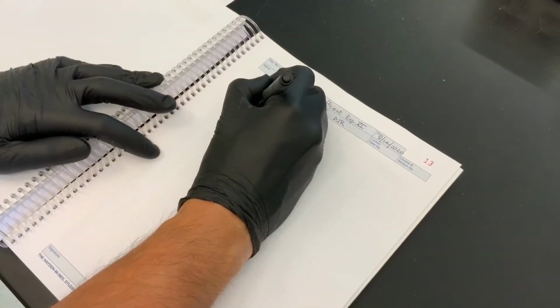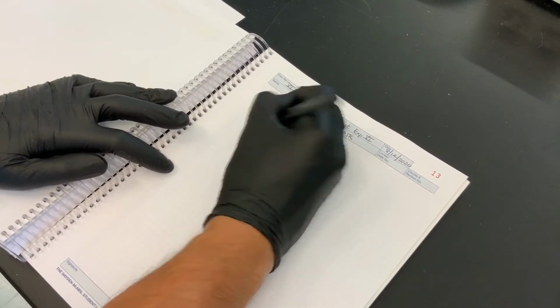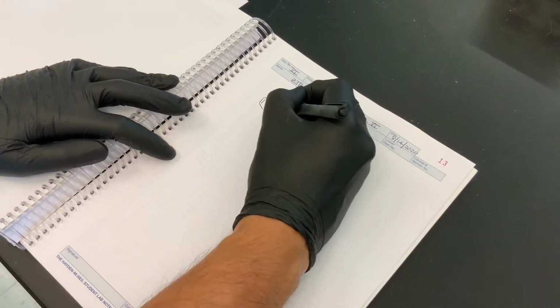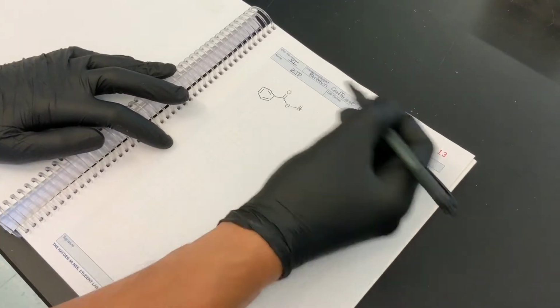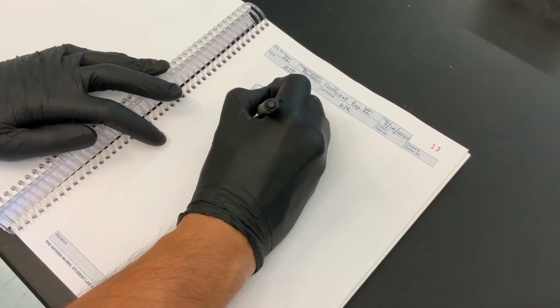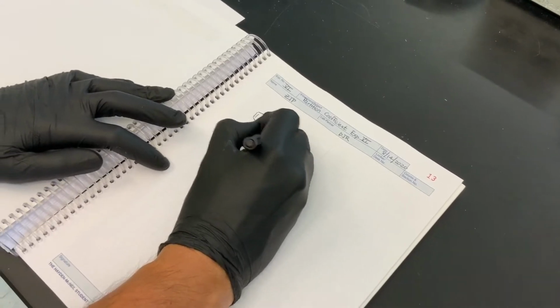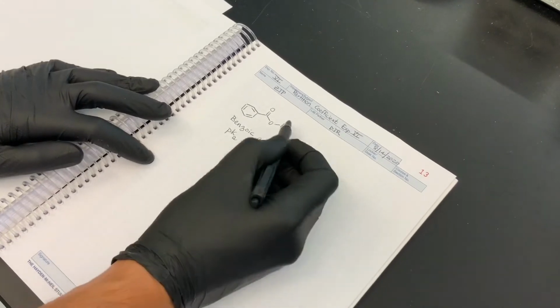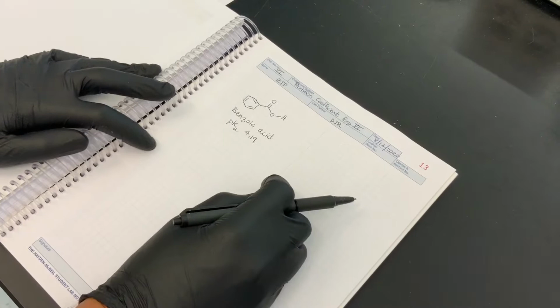All right, so let's go ahead and draw the structure of benzoic acid. So I have a benzene ring, and then coming off of the benzene ring is a carbonyl group, and then attached to that is an OH. Right. So here this is very clearly a carboxylic acid functional group, and this is called benzoic acid. An important physical property to know for this experiment is its pKa value. And it emphasizes the fact that in the name, acid, that benzoic acid is a weak acid.